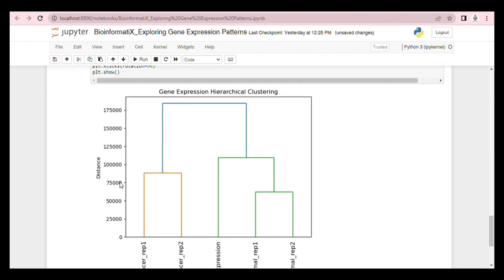And here we have the gene expression hierarchical clustering. In the hierarchical clustering dendrogram, the distance on the y-axis represents the similarity or distance between samples based on their gene expression profiles. A shorter distance indicates that the gene expression profiles of two samples are more similar, while a longer distance suggests that the profiles are more dissimilar. In our case, the distance values of 60,000 for normal samples and 70,000 for cancer samples suggest that the gene expression profiles of normal samples are slightly more similar compared to the cancer samples.